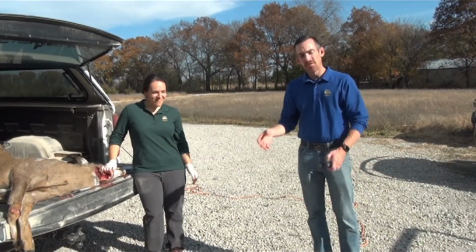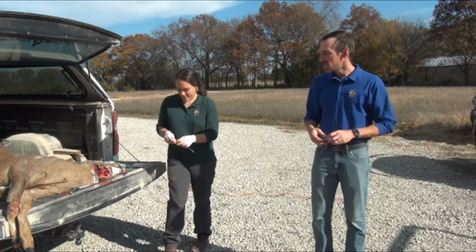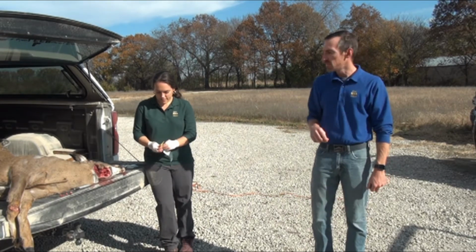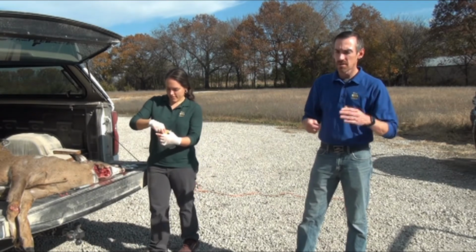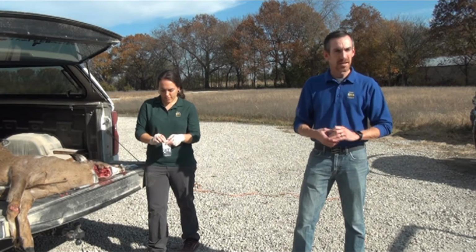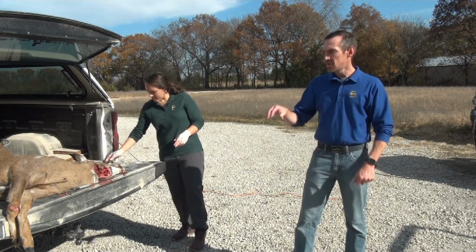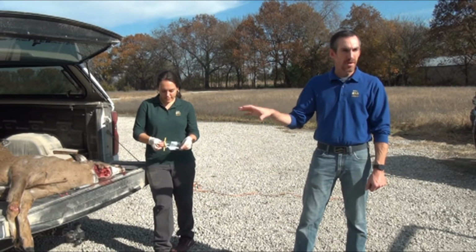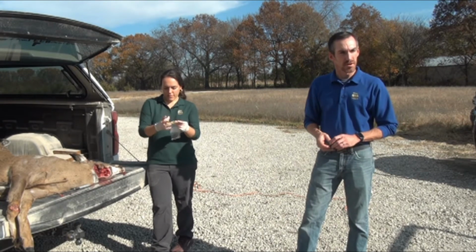Okay, so Dr. Rudin's now removed both of the lymph nodes, so what we're going to do next is place them in the bags. So when you're doing this on your harvested deer, first we put one lymph node in each of two separate bags. So we're keeping those two lymph nodes separate. And then for your reference, and actually for reference for the sampling process or the testing process, what we often ask hunters to do is write the registration number on the bag, and that again is the 9-digit number on your deer tag. And the nice thing about that number is that it's unique to this individual deer. So if you were to harvest multiple deer, then you could reference that number if you were wanting to look up the test results for this individual deer.